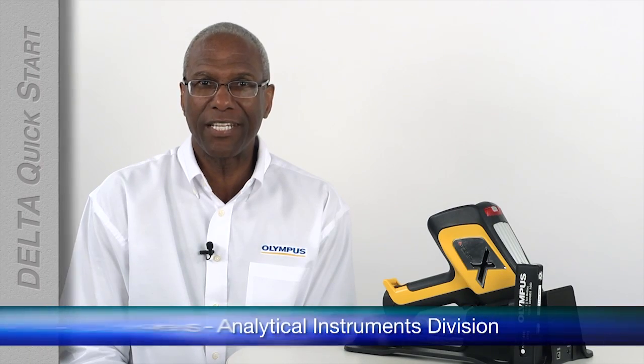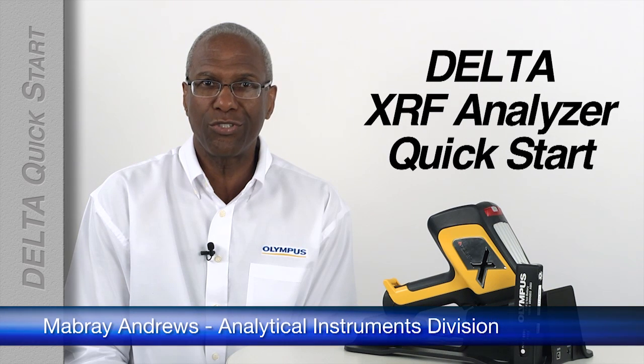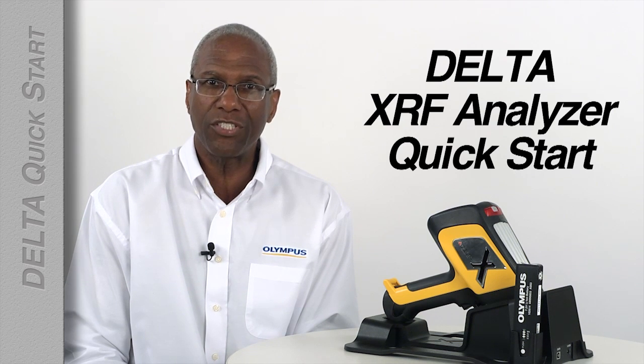Hello, my name is Mabry Andrews. This video will show you how quick and easy it is to use your Olympus Delta XRF analyzer right out of the case and how to be safe when using it.